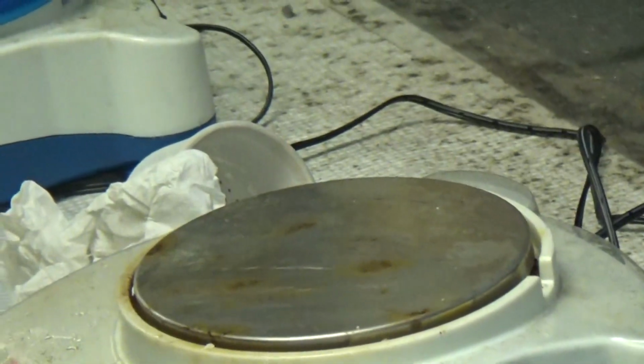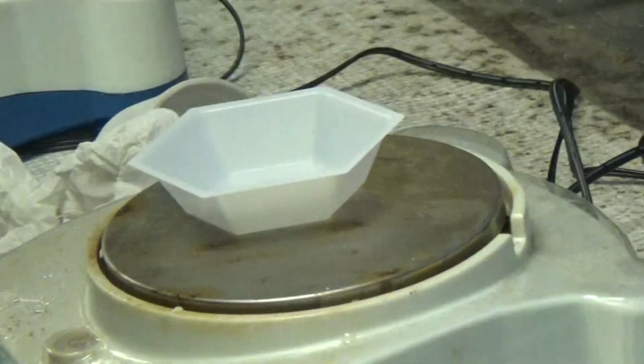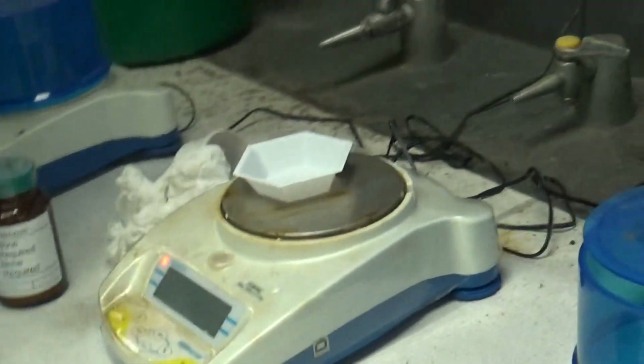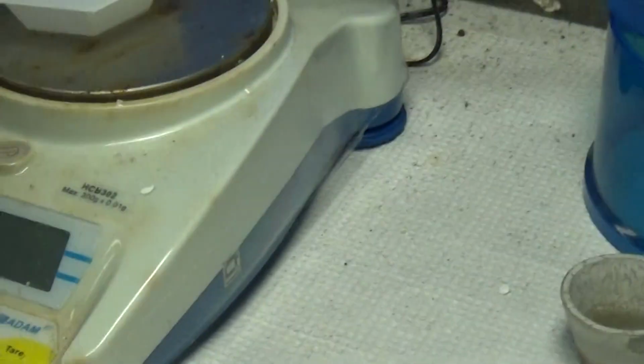Clean the balance. Always got to be considerate for the next person. It's a 0, huh? Not zeroed yet, it's still being funny. I cannot see why.